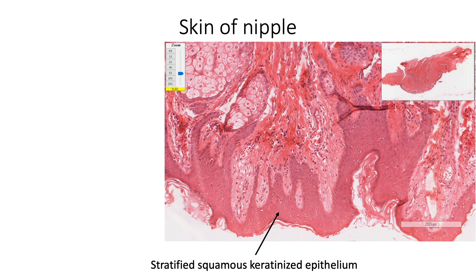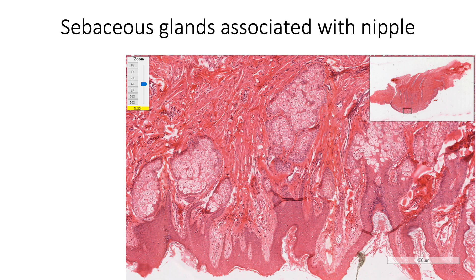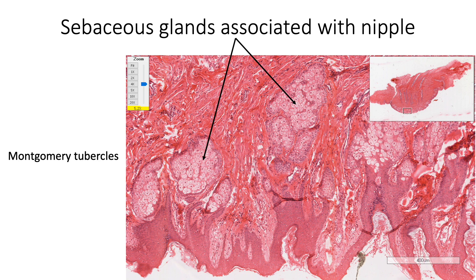As this epithelium is highly wrinkled, it is associated with the presence of long dermal papillae. Numerous sweat and sebaceous glands open directly on the surface of the nipple. Oily secretions from the sebaceous glands, as seen here, act as a protective lubricant. These glands become visible as Montgomery tubercles on the surface of the areola in pregnant women.